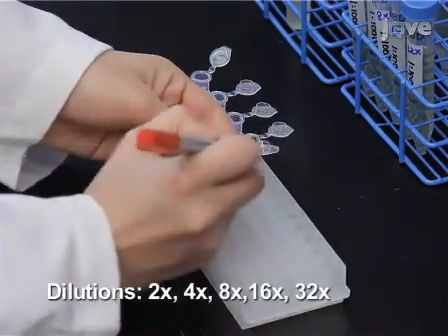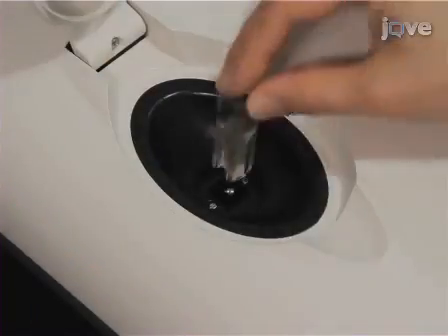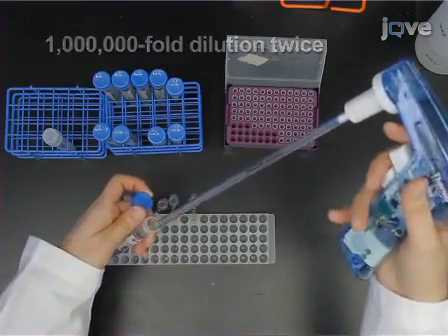Prepare serial two-fold dilutions of the overnight culture. Then measure the absorbance of each dilution at 600 nanometers by spectrophotometer in triplicate. Further dilute each bacterial suspension 1 millionfold.